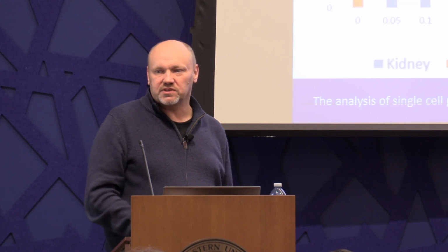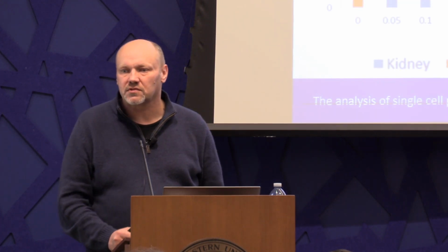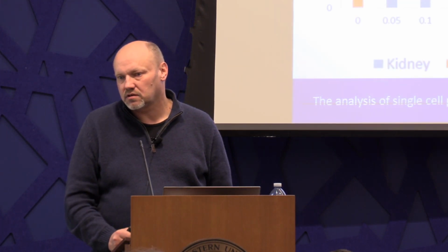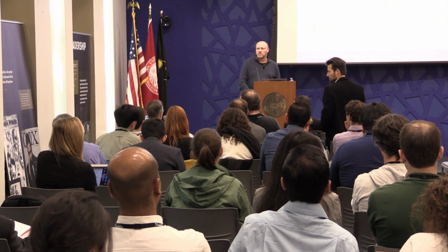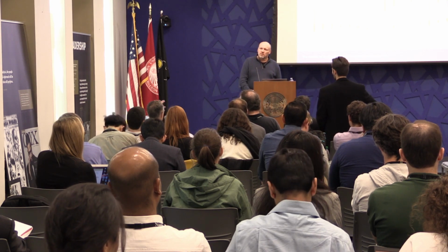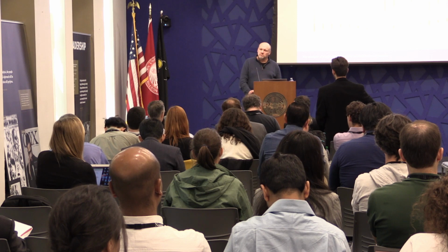So then, yes, please. The PCA is controlled by very few components or variables. I can imagine that if some of those entries are very large, the normalization is acting only on those entries, but low abundance ones will not be normalized properly.